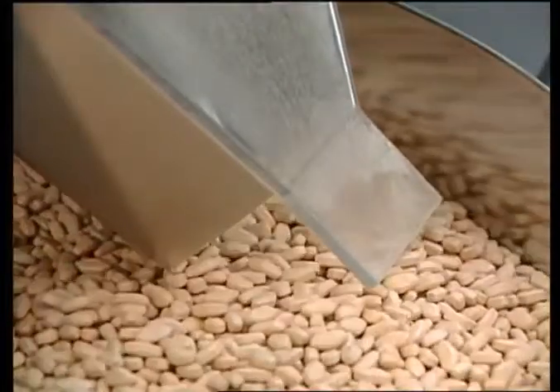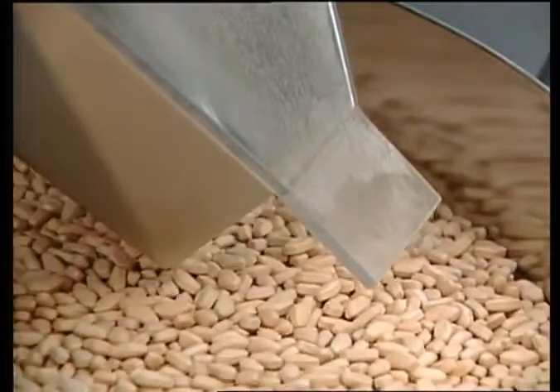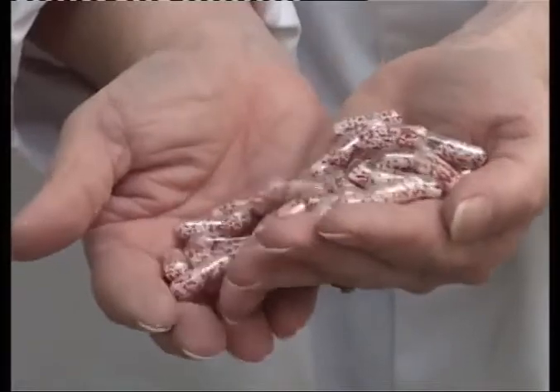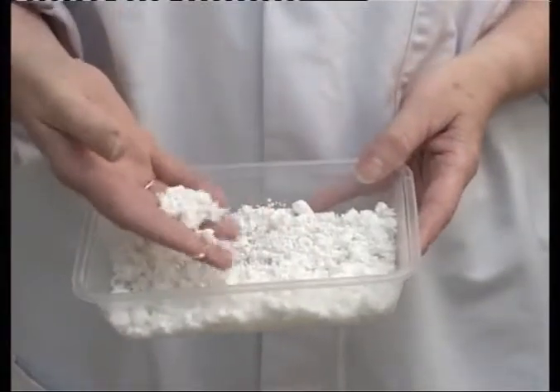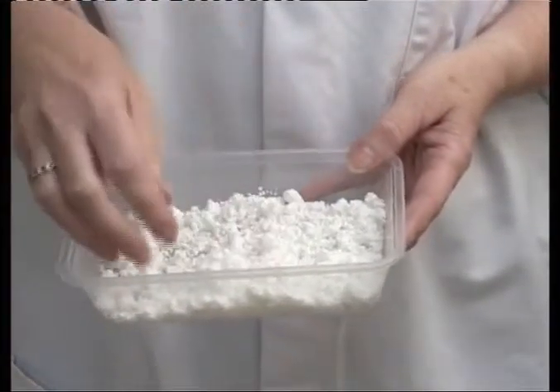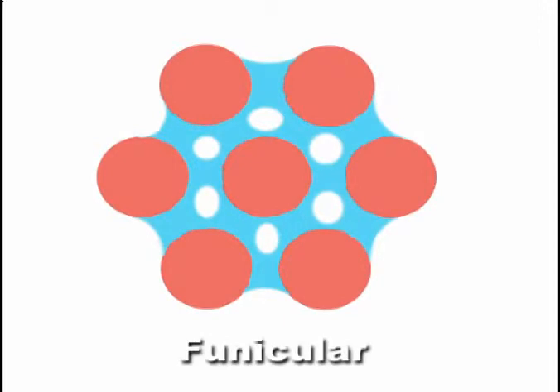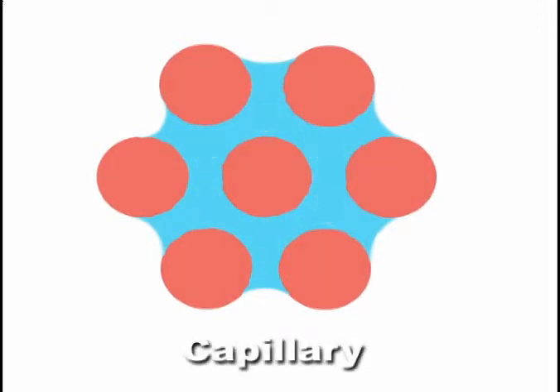Since the properties of a wet granule have a critical effect on the resultant dry granule, tablet, extrudate or spheroid, a quantitative measurement of the rheological properties or consistency of a wet granule is valuable. The consistency of the wet mass is a function of the distribution of the granulating liquid in the available pores and voids between the powder particles and has been shown to be related to the end product properties.